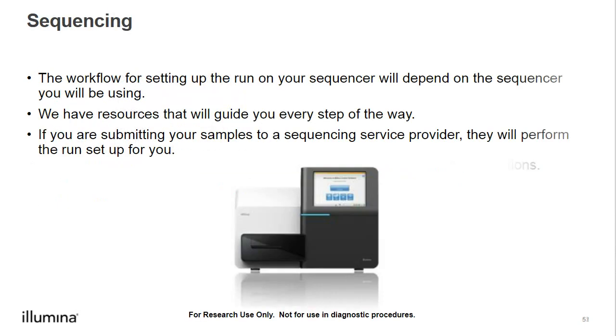When we are ready to sequence, the workflow for setting up the sequencing run will depend on the specific platform that you're using. We have resources on our website to help you every step of the way with this. If you are submitting your samples to a sequencing service provider, the provider will perform the run setup for you after they've received your samples.